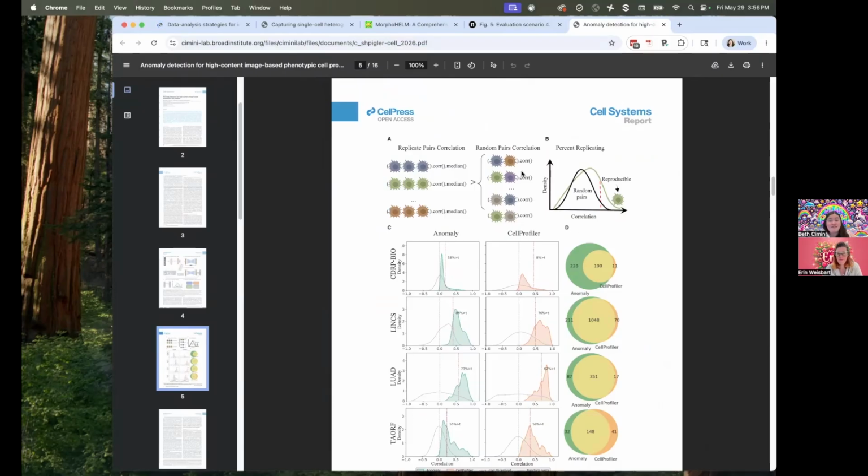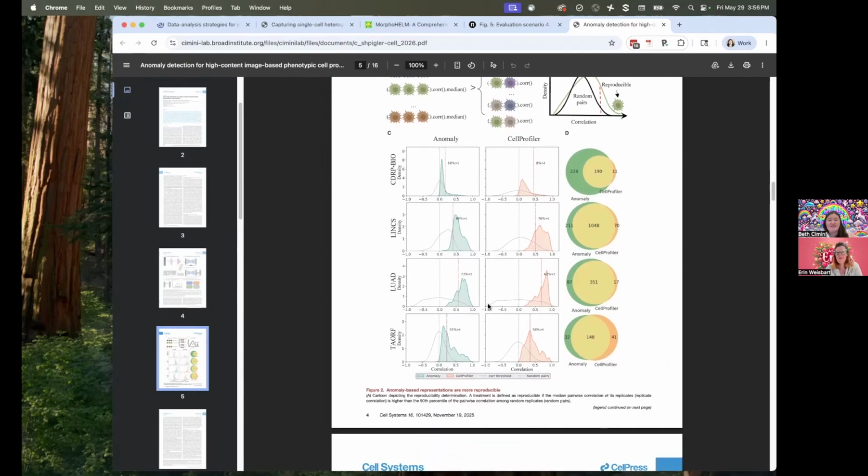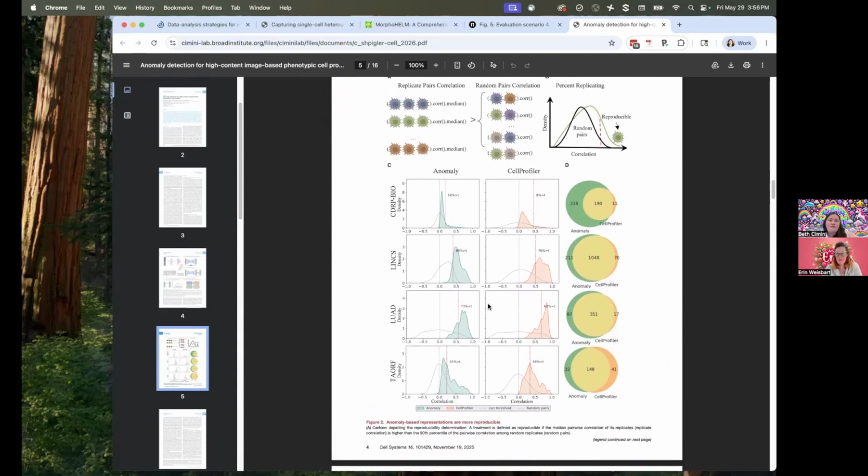And then do these anomaly profiles, and that will possibly give us a distribution that is easier to deal with or easier to integrate. Spatial transcriptomics also deals with things like this, because gene counts can be very unequally distributed, and so there are libraries, like MOFA, that have methods to account for underlying distributions having different shapes.